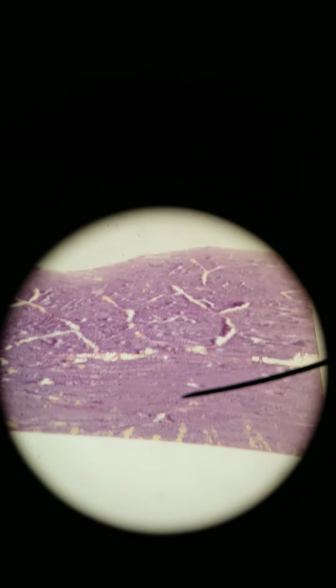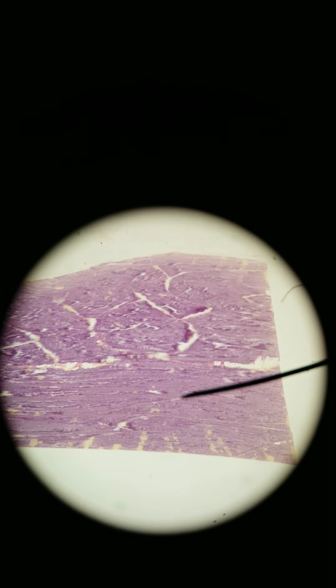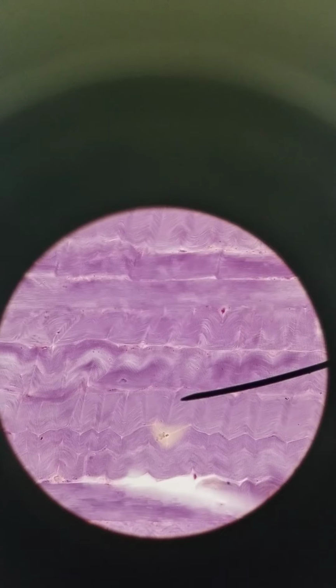stained just for striated muscle, and I'm going to use that to show you striations and all the features of a muscle fiber. So the staining for this particular muscle is different so that the striations come out a lot better. So this is still longitudinal skeletal muscle, a longitudinal cut of skeletal muscle, 40x, 100x. You can see the individual fibers now going left to right, very, very long. And 400x, great.